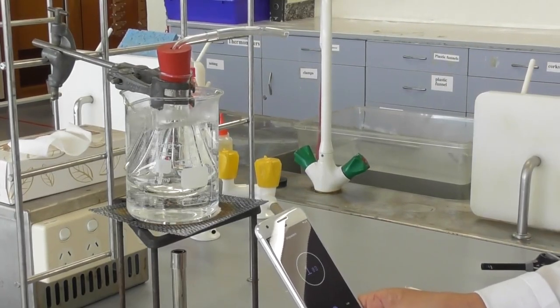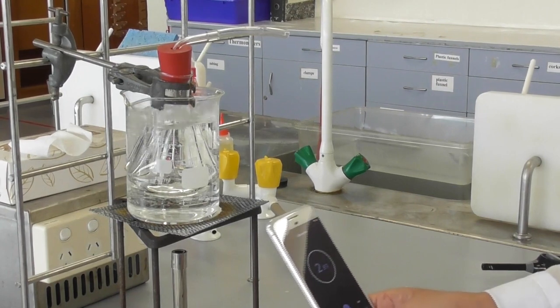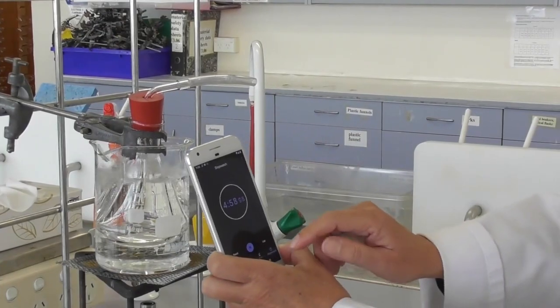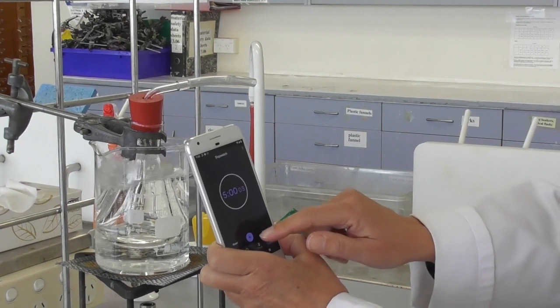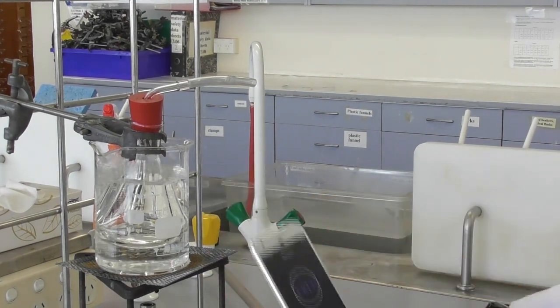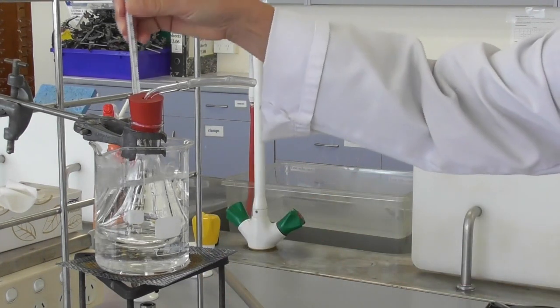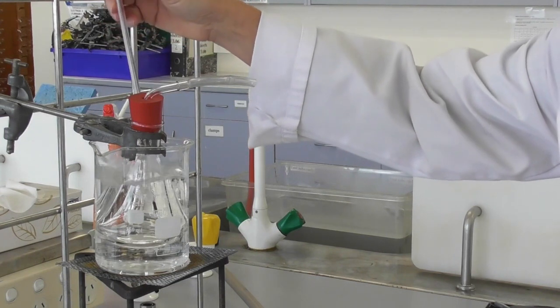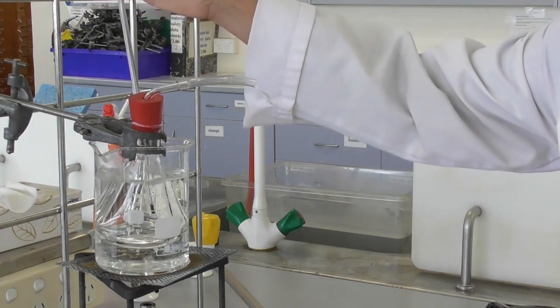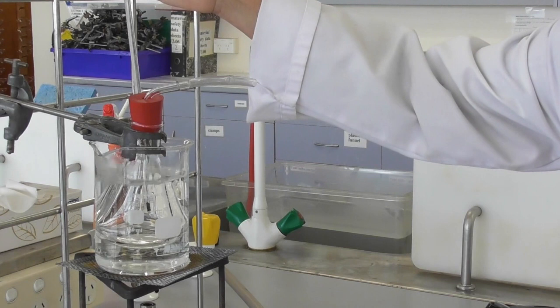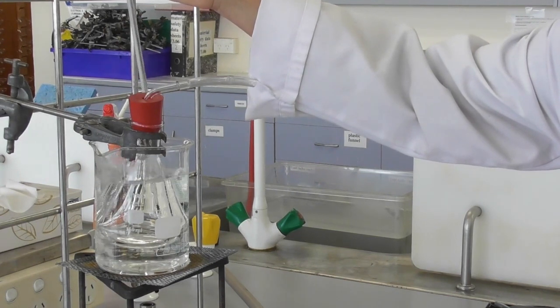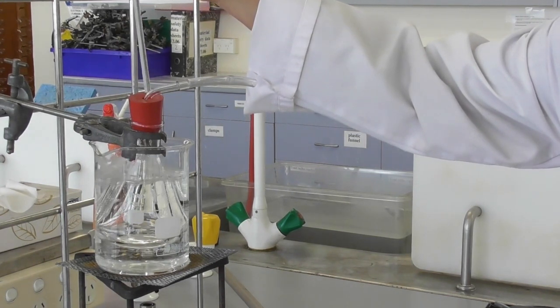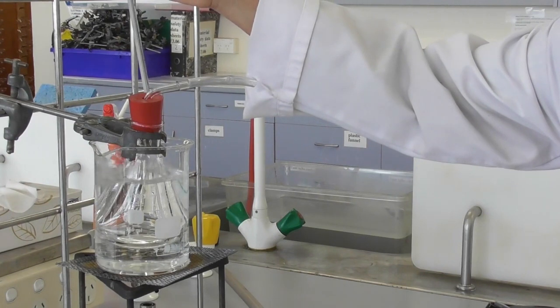Once it's boiling we start the timer. It needs to be boiling for five minutes so that the temperature inside the flask can adjust to the temperature of the boiling water. We take the temperature of the boiling water and then make the assumption that it is the same as the air inside the flask.